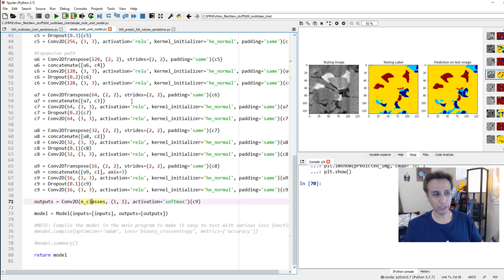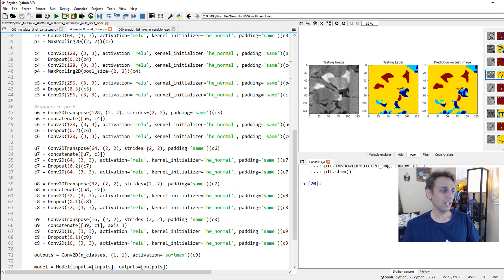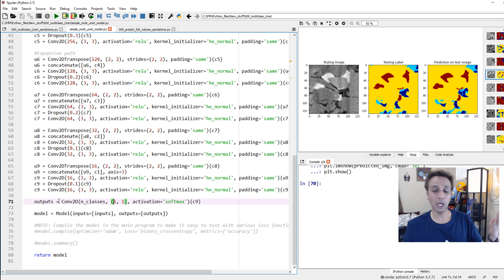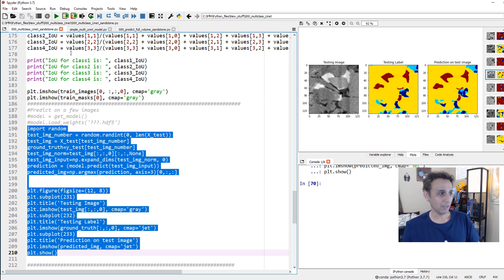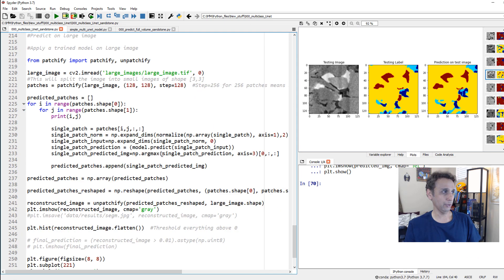Let's go back to our original code. We're not going to touch the model, but just to highlight - the only thing we changed in our UNet model is adding the number of classes as 4 instead of binary, and outputting 4 classes as the output. That's it - just a quick reminder, not directly relevant for this tutorial.